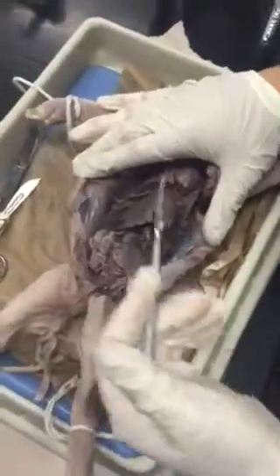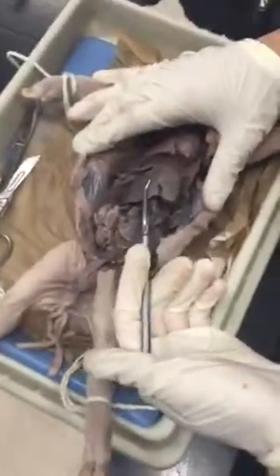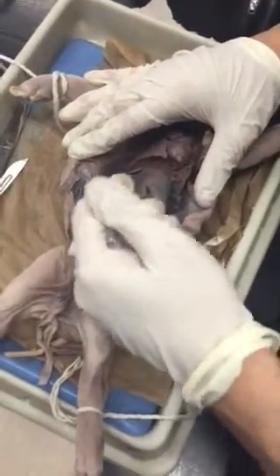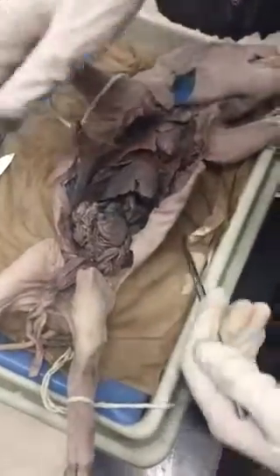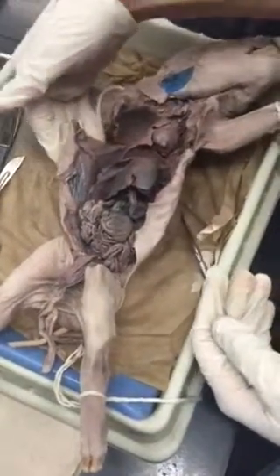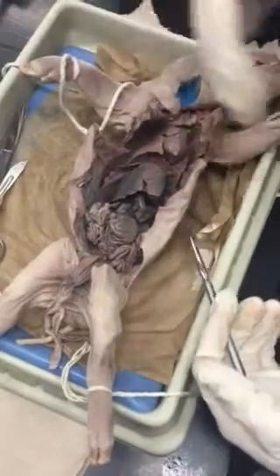So when you start doing your dissection, you're going to notice this big part right here. This big part is called your liver. The liver is separated into multiple parts. Each has its own name and is in relation to the sides of the pig, which is usually lateral and central, and then depending on left and right.